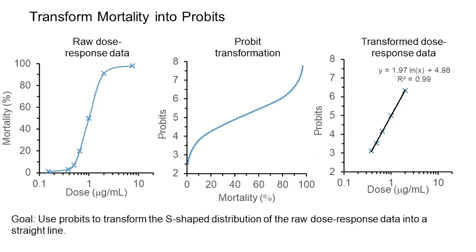We linearize the dose response by plotting the number of individuals dying for a known number of larvae exposed at each concentration of the control agent being tested by plotting mortality as probits. The percentage of mortality at each of the doses tested in the bioassay is based on a binomial outcome. Larvae are either dead or alive.